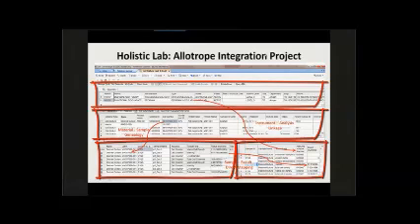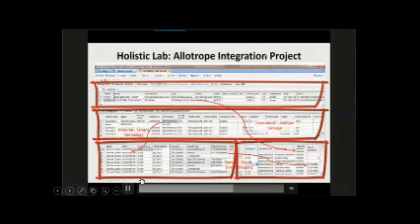You know which lot of material it came from. And then finally, the result actually knows who ran it, which instrument collected that, and also which sample, for what purpose, from which material lot. Now everything is connected. That is the holistic lab that we're trying to get to.